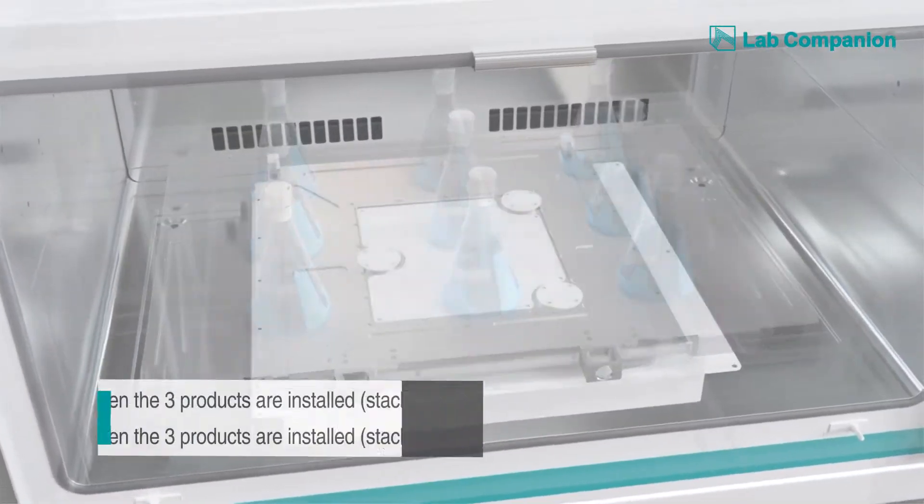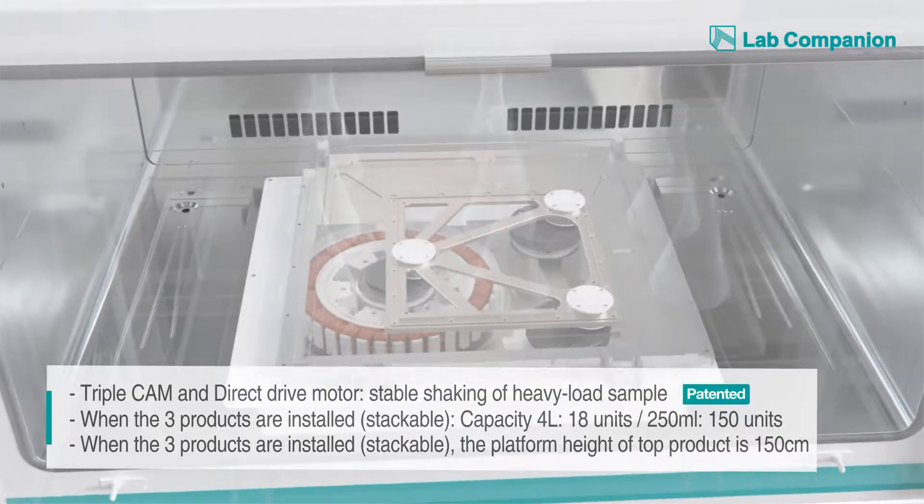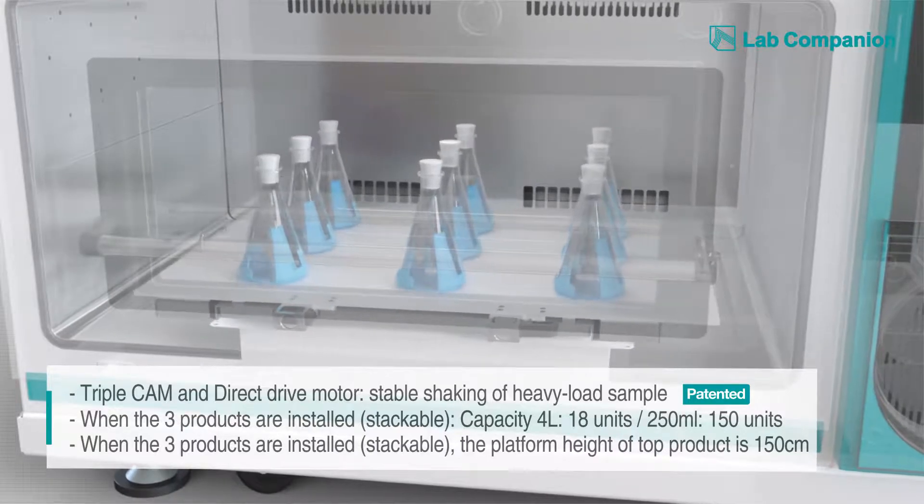By adopting the triple cam system and DD motors, our product achieves the minimum level vibration as well as the maximum level stability when stirring a heavy load sample.